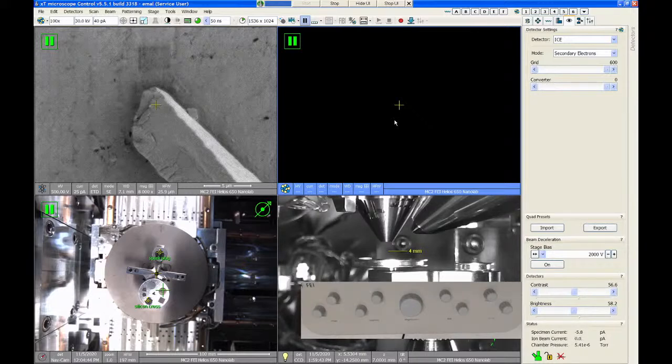True. So then I would have to use some other method to try to image the polymer without coating. Yeah, so I can show you a technique to use the platinum gas injector inside the FIB to coat that surface after you cut it. And you can do a really, really thin layer of platinum that will still show up in the x-ray spectra, but it's much, much thinner than a gold coating would be. And you can actually do x-ray mapping and things like that through that thin platinum layer. That would be my suggestion if you're going to be doing this on the FIB.